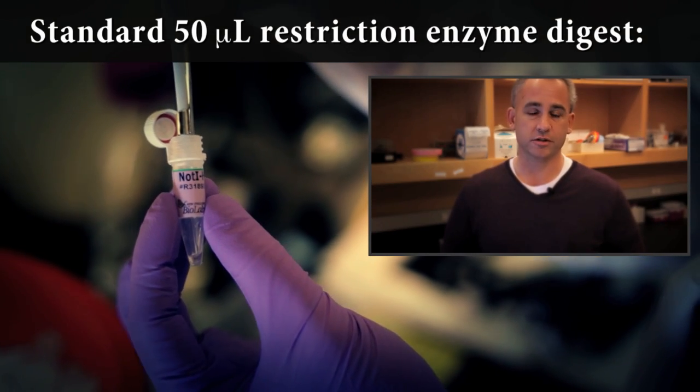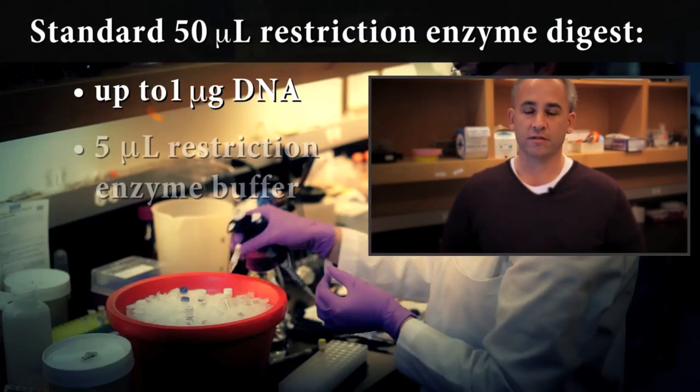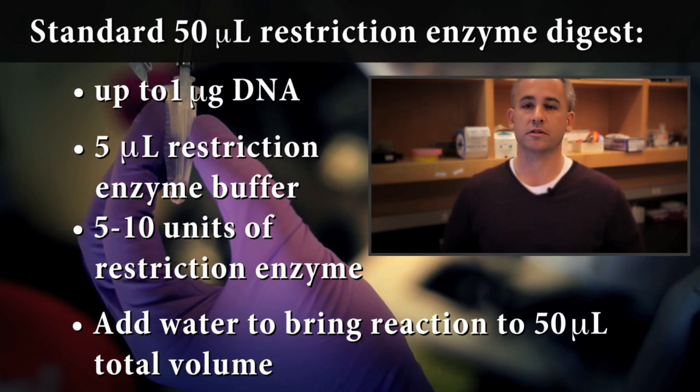A standard reaction is 50 microliters. It calls for 1 microgram of your target DNA, 5 microliters of the restriction buffer, 5 to 10 units of enzyme, and then supplementing the rest of the 50 microliters with distilled water.